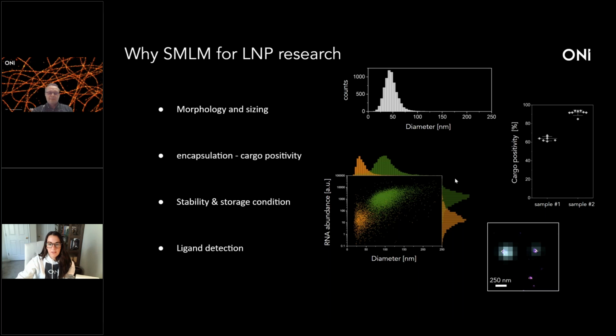Great, thank you for that, Stefan. The next question is, how many LNPs do I need for this assay? Yeah, this is a tricky question, but I can tell you that if your RNA concentration is somewhere around 0.1 mg per ml, so 100 micrograms per ml, you will need to do a dilution of 1 to 50,000. So you can see that the dilution of your LNPs is very high. You will need like 1 microliter to 50 ml of PBS in this case, or it can be your storage buffer. So you don't need too many particles.